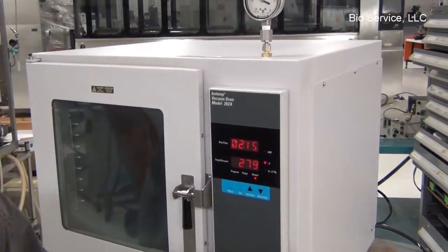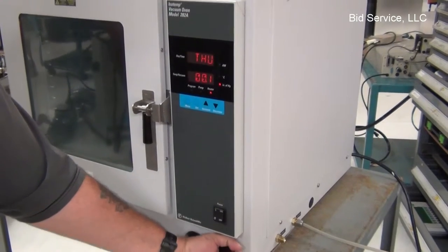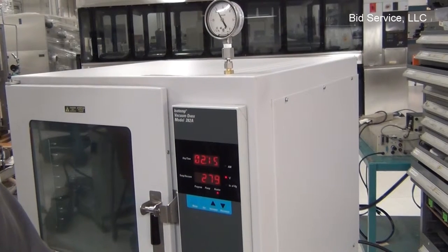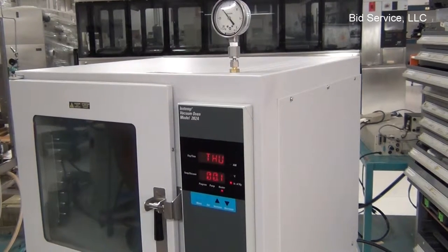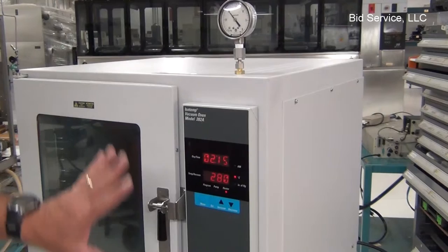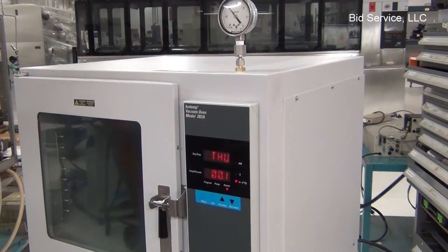When I open up the purge vent, the vacuum will decrease. And then when I stop it, it'll stabilize again. It's been tested with a thermometer, so it's accurate, and all the controls are functional.